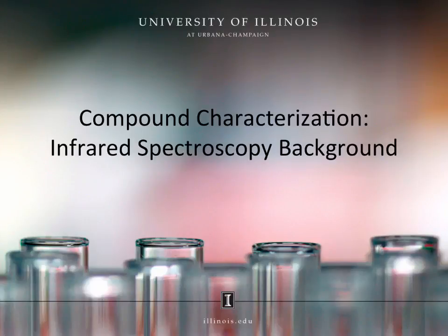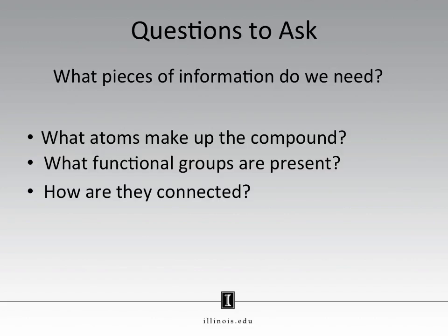Compound characterization, infrared spectroscopy background. In this webcast, we will discuss the theory behind infrared spectroscopy. At the end of the Introduction to Spectroscopy webcast, we discussed how we needed certain pieces of information in order to identify an unknown compound. This webcast will discuss infrared spectroscopy, which will help us identify what functional groups are present in our molecule.